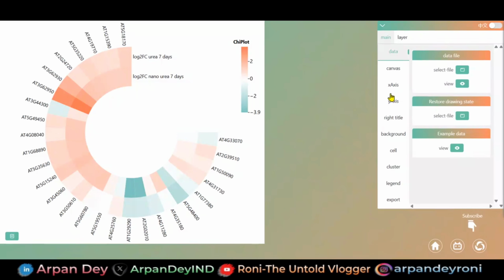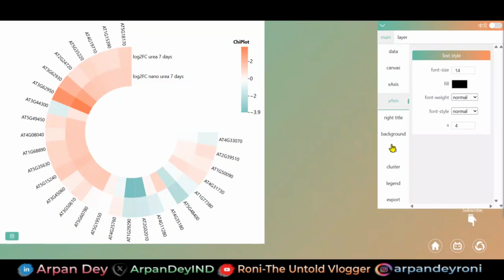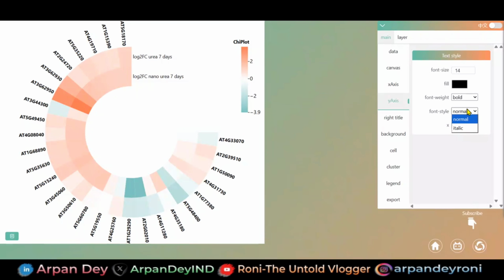Same as the previous one, you click on the x-axis, y-axis, cell, whatever you want to play with. Let's say I am with the y-axis, so the y-axis is this one. Click on font weight, let's say make it bold. Also, as we know, gene names should be in italics. Click on italics and you will see the gene names change to italics. Also in the x-axis you want to make it bold, so font weight should be bold. You can see that it turns bold. Also the italics should now be normal, so keep it normal.